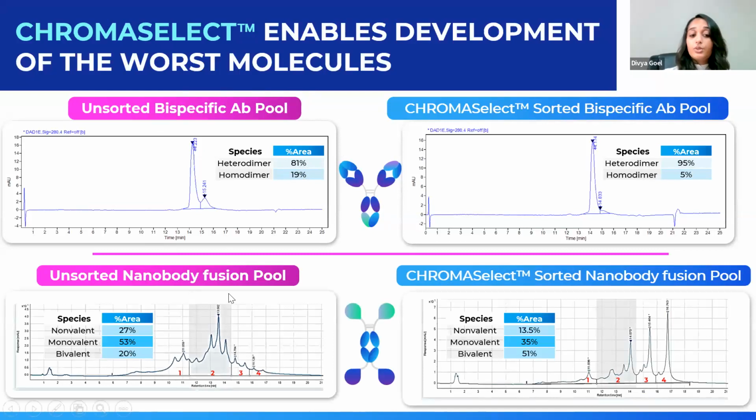And here is another example of a molecule that we sorted. It's a nanobody fusion protein. In this particular instance, it is a bivalent nanobody fusion where the C-terminal region was prone to truncation or degradation, and that would render the molecule essentially non-valent. So we ran the molecule in a cation exchange HPLC assay.